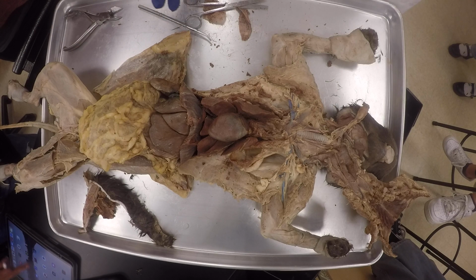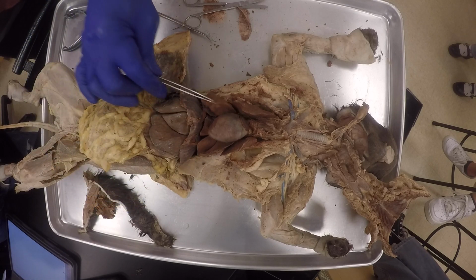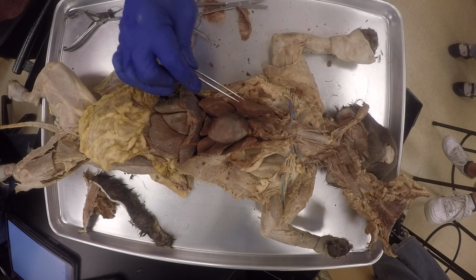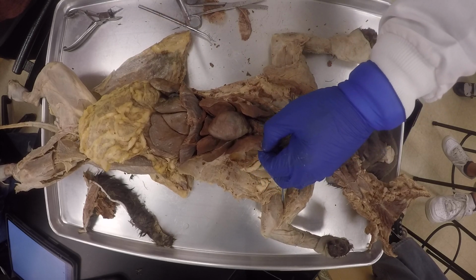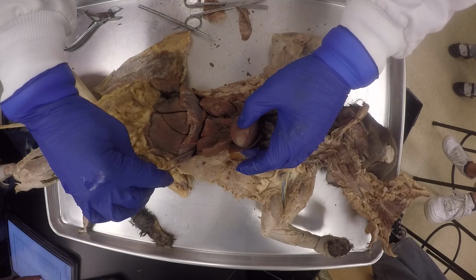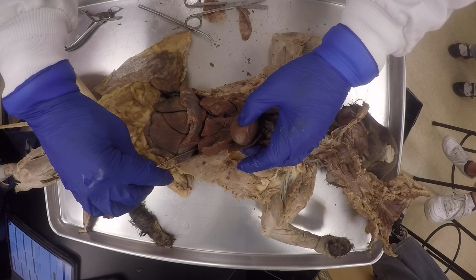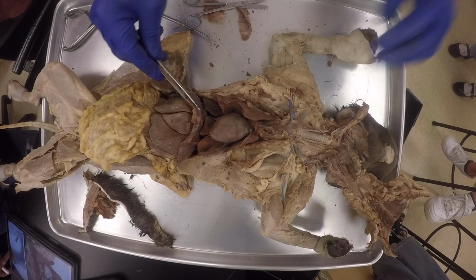So you write those down: left cardiac lobe, right cardiac lobe, right apical lobe, left apical lobe, intermediate lobe, left diaphragmatic lobe, right diaphragmatic lobe, and finally the diaphragm.